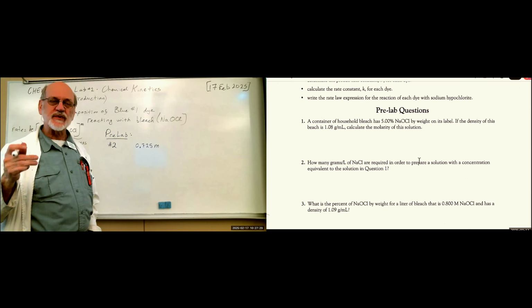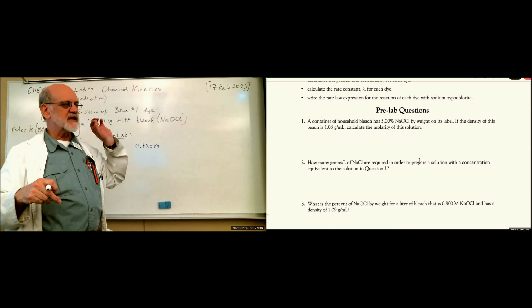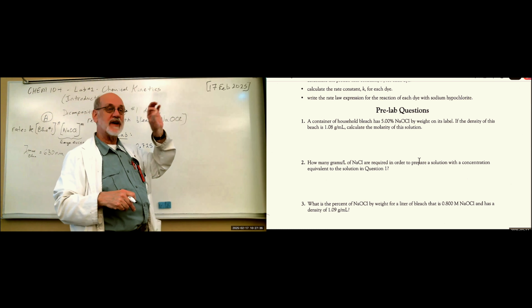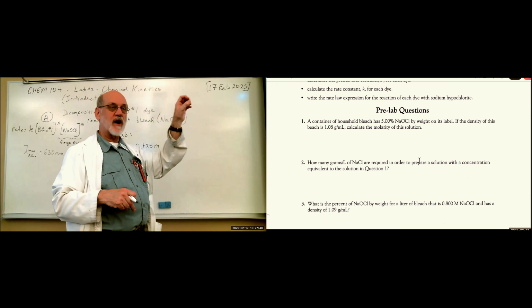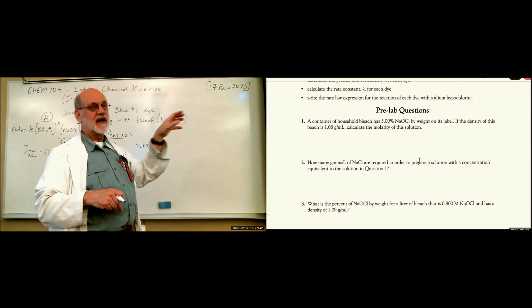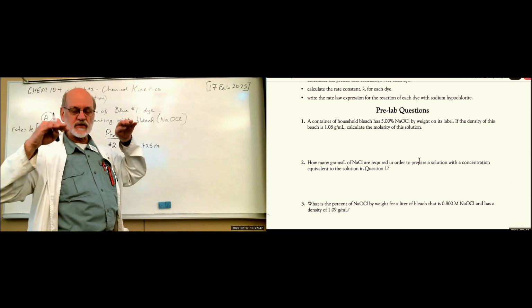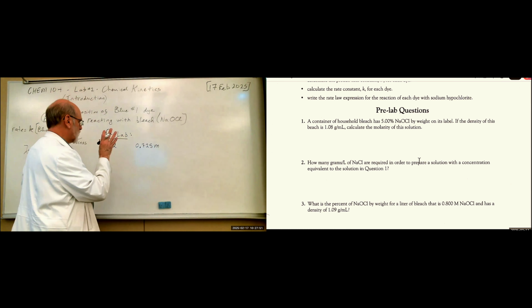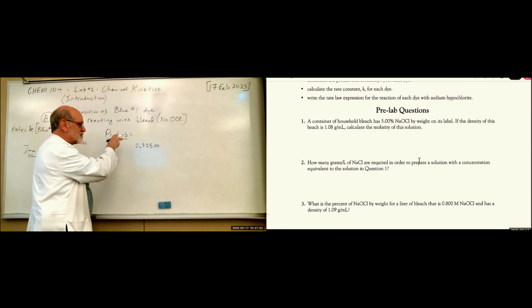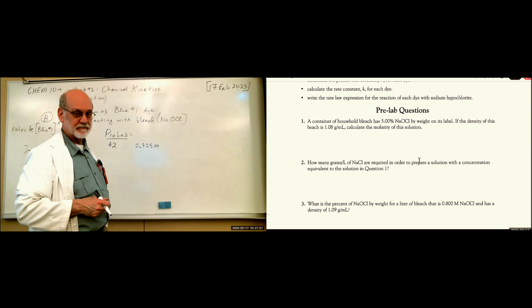Well, the sodium chloride needs to be the same concentration as the bleach, because if we put, say, 10 drops per cuvette of the bleach for our experiment, then we want 5 drops in the second experiment of bleach and 5 drops of sodium chloride. But they need to be exactly the same concentration to maintain the balance. So that's why we want to calculate how to make that solution out of sodium chloride.